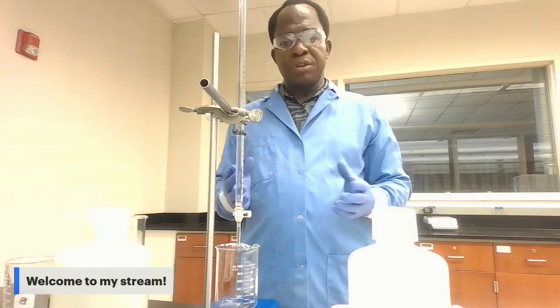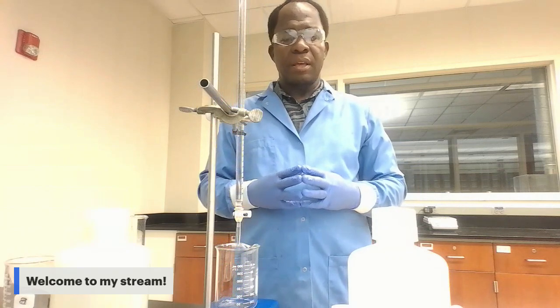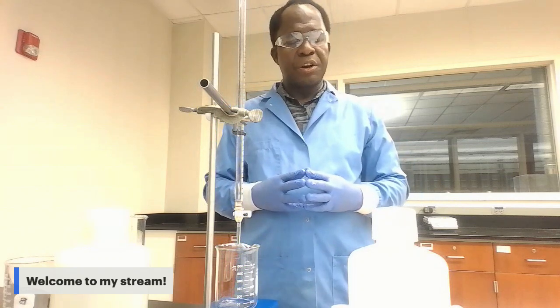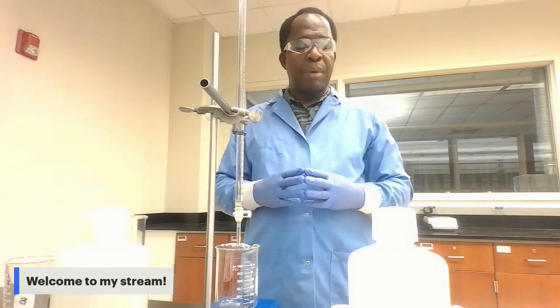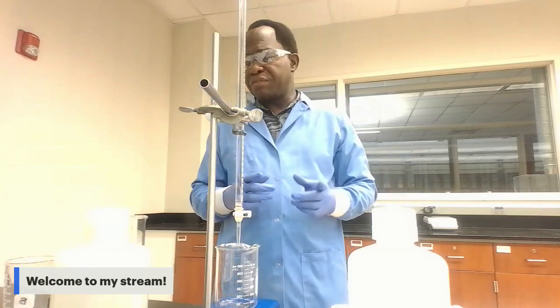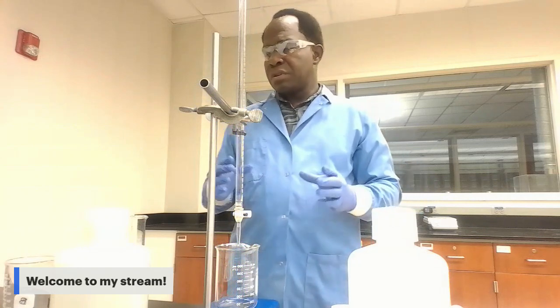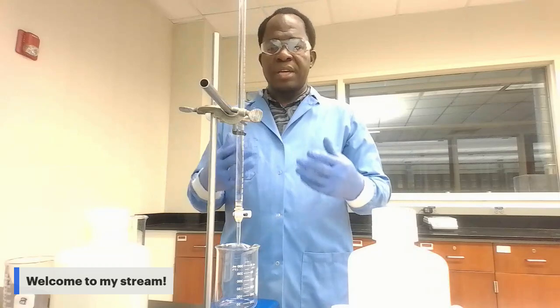The procedure of this lab has two parts. Part one is the preparation of the burette, and part two is the titration itself. But before you start the titration process, you also have to get the calcium hydroxide ready.